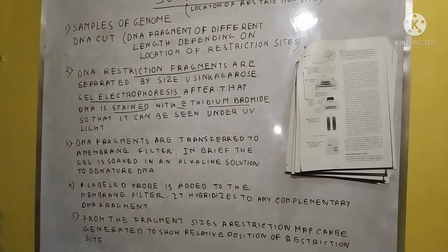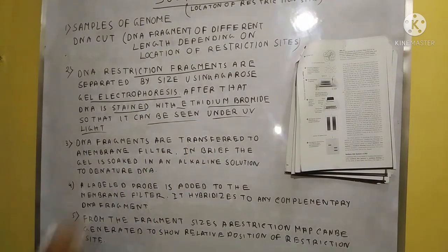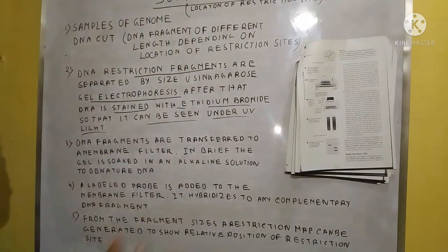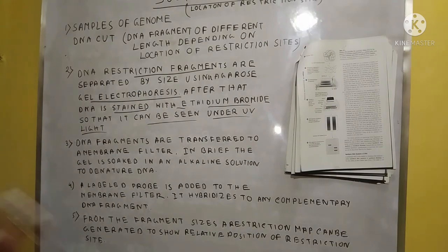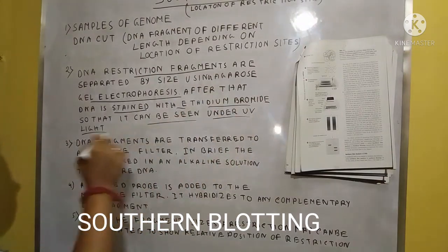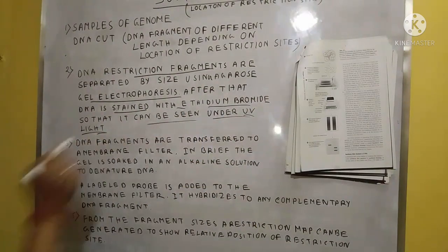Why is it stained with ethidium bromide? Because without staining, without coloring the DNA, we cannot see it under the UV light. So first we cut them into fragments, then transfer them to gel electrophoresis, and then the fragments are stained with ethidium bromide. Clear? For seeing them under UV light.